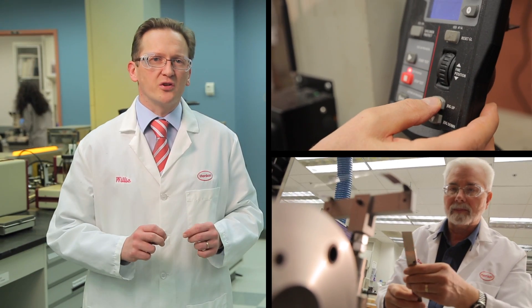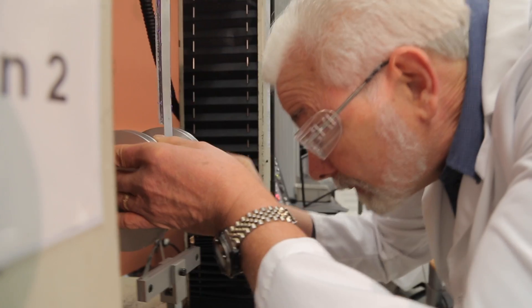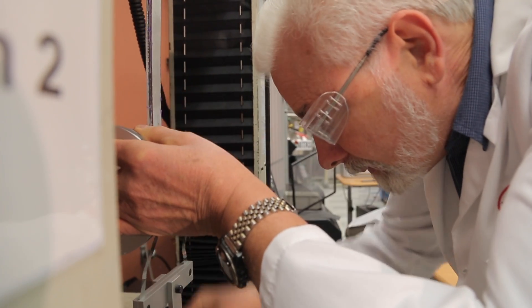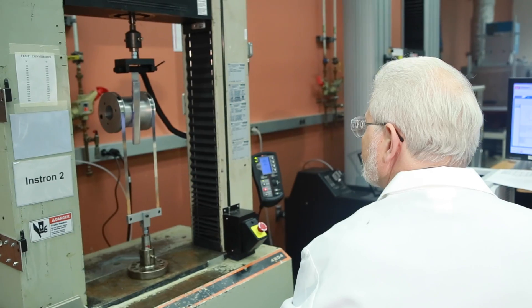A bonded assembly is secured in the climbing drum peel fixture in a mechanical properties tester. As the crosshead moves upward, the flexible substrate is wrapped around the drum fixture.